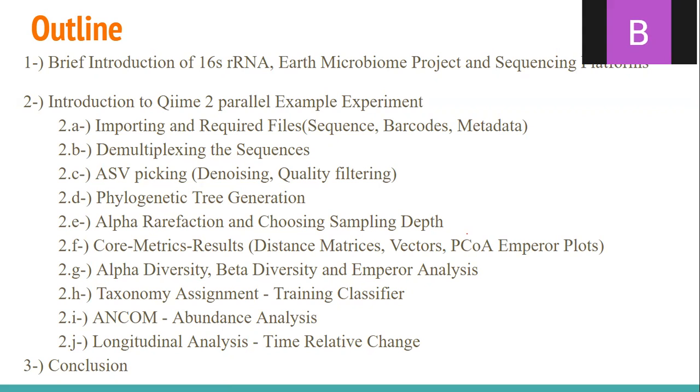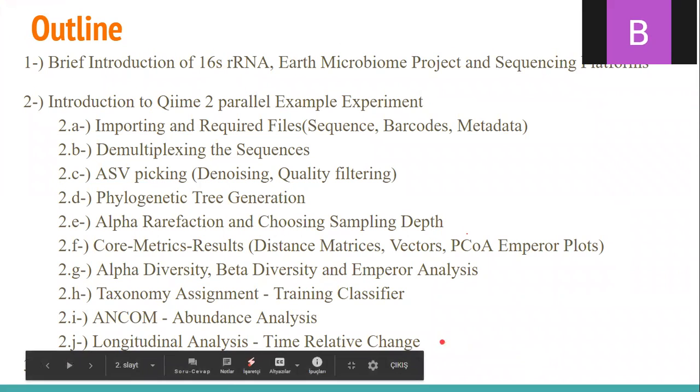The experiment is about testing the hypothesis of whether the microbiome in the mice contributes to the development of Parkinson's disease, or whether Parkinson's disease influenced the fecal microbial community diversity. The analysis of this experiment and the basic introduction for my report will be done. Then, roughly, I will be talking about what has been done for my 3 experiments in my report.